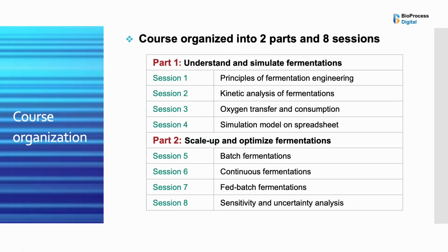The course is structured into two parts, comprising a total of 8 sessions. Part 1, Understanding and Simulating Fermentations. This section introduces the foundational principles and tools required to analyze and simulate microbial fermentations: principles of fermentation engineering, kinetic analysis of fermentation, oxygen transfer and consumption in fermenters, construction of simulation model on spreadsheet.